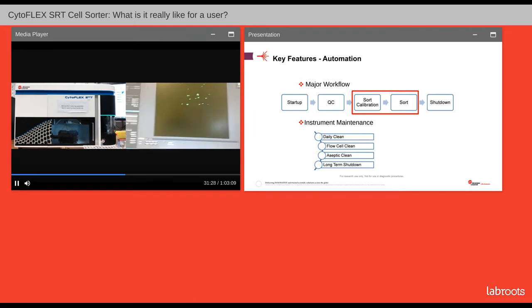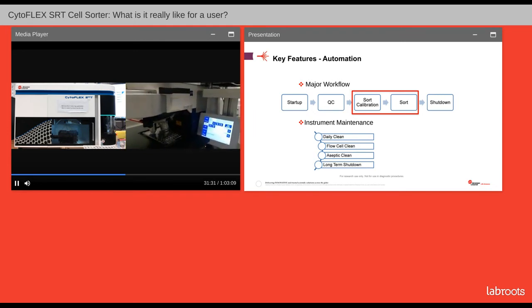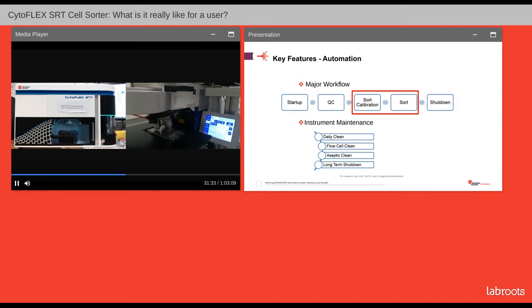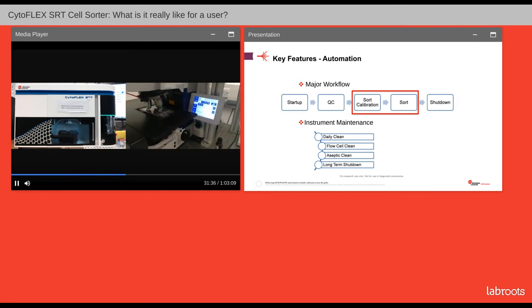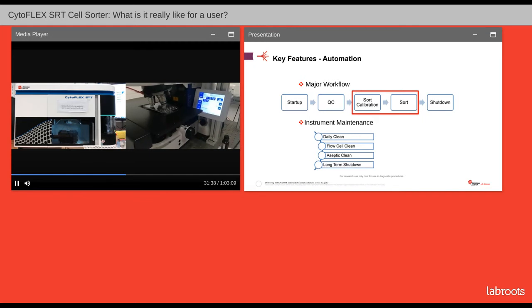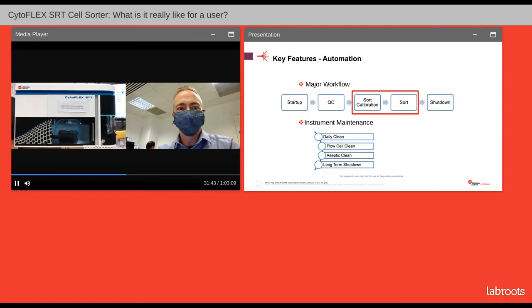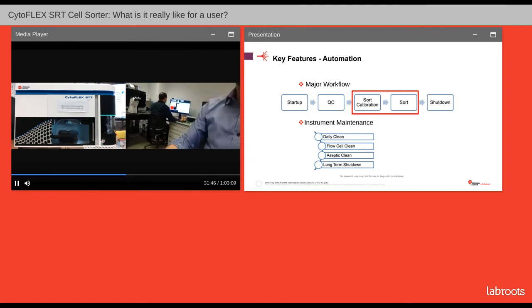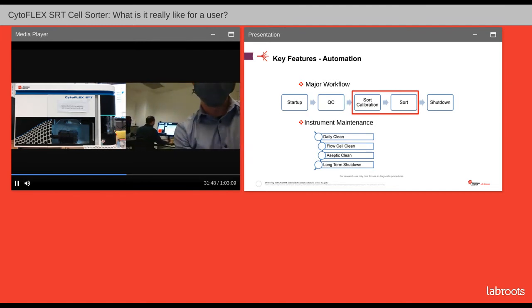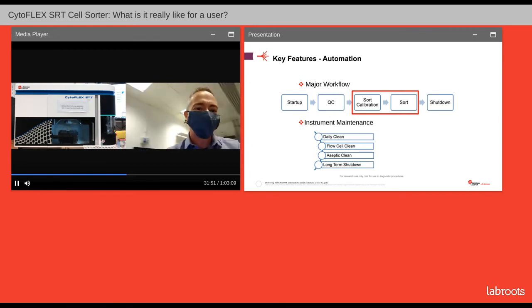Brilliant! It's imaging nicely on the confocal. I've even got another witness besides the live one — that's on the Aliva 7. Karen, back over to you.